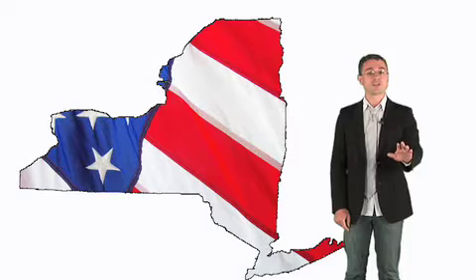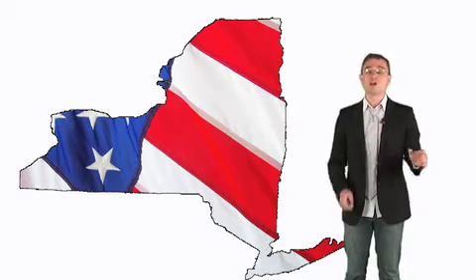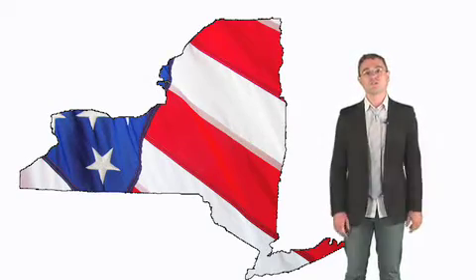Try the Bullet Blender in your lab for 30 days. If you're not completely satisfied, we'll give you back your money and pay the return shipping.